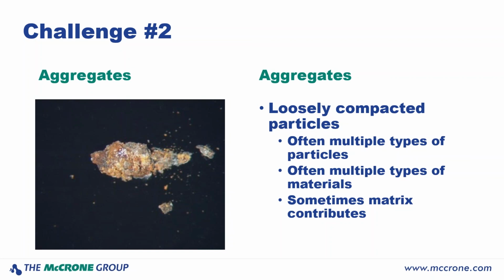So whatever material this aggregate was retrieved from also needs to be sampled and analyzed with the aggregate so that we know which parts can be attributed to the matrix and which parts are truly foreign. Oftentimes, too, you'll see that maybe these brown areas are just melted or burned matrix, so we need to consider the condition of the matrix at all stages.